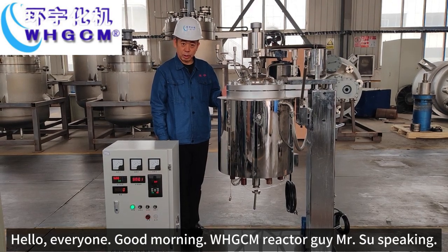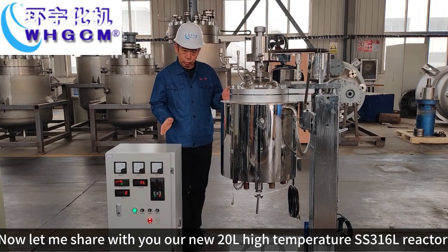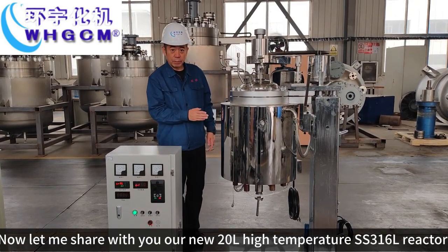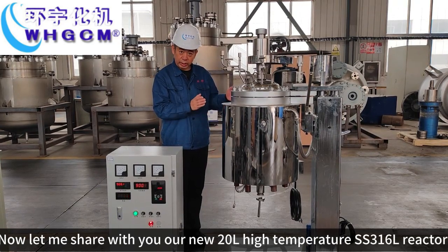Hi, everyone, good morning. WHGCM reactor guy Mr. Su speaking. Now, let me share with you all our new 20L high temperature stainless steel SS316L reactor.